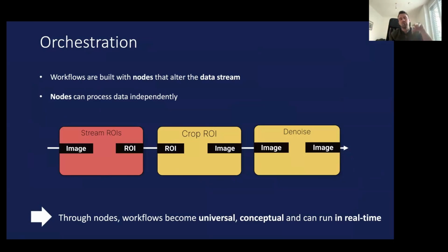Imagine you have a task where you want to just segment the cell bodies and then run some analysis task, but you would really like to have some feedback before. The tasks that take longer can take longer, and you can process your data already. And they run in real time. So there's no delay, no scheduling. Once you mark, for example, this ROI, it gets sent through the whole pipeline immediately. And the next one, the same.